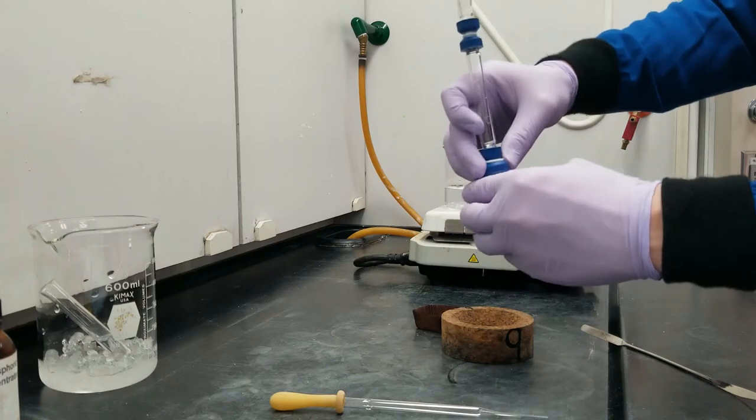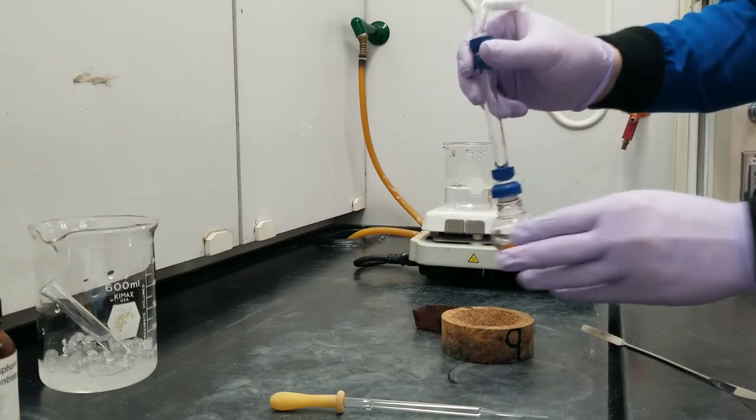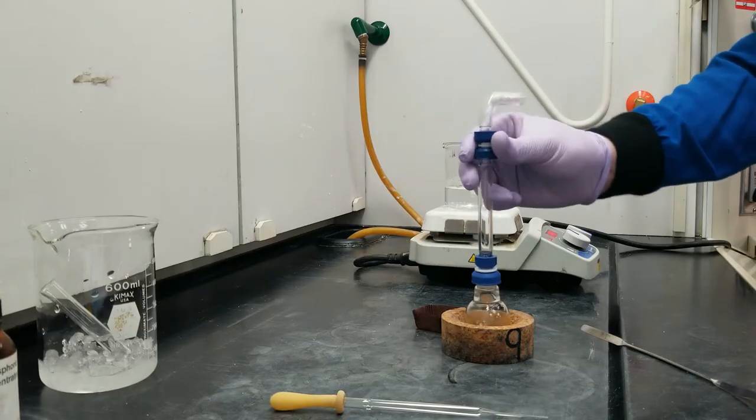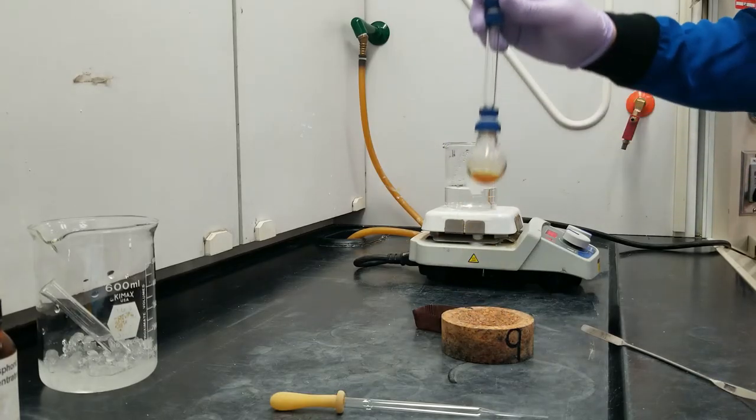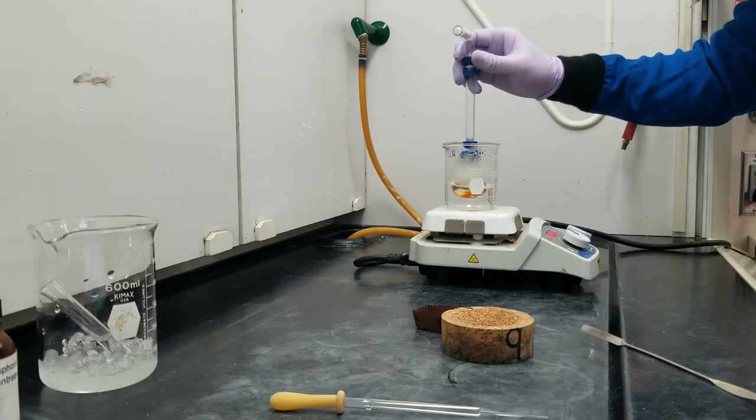And I'm going to go ahead and attach my air condenser and my drying tube. Give it a quick swirl. And into heat, we're going to go. And just a gentle swirl.